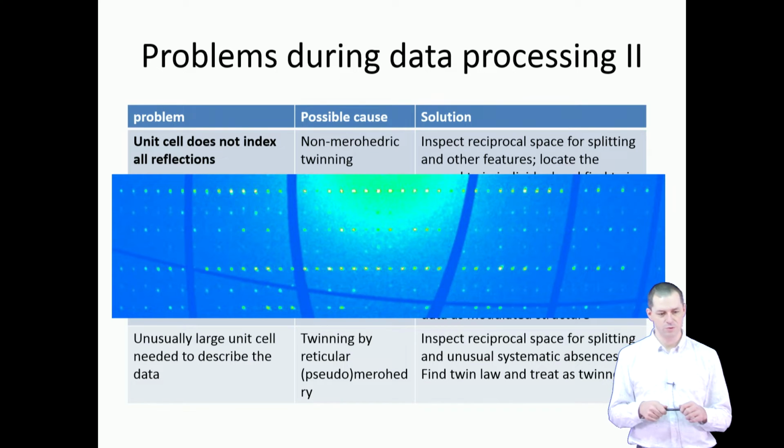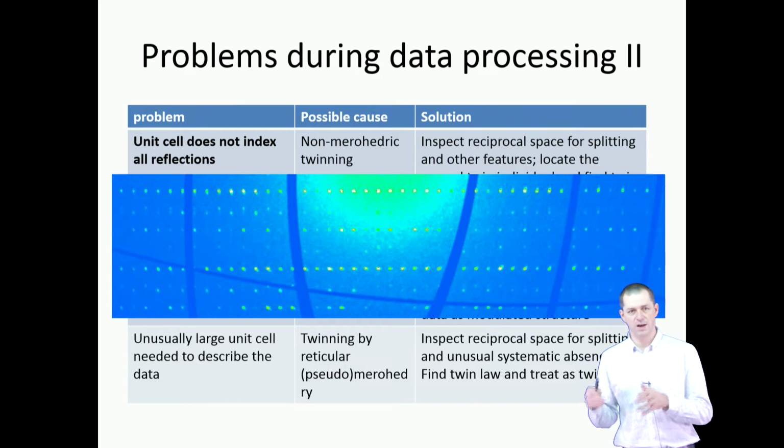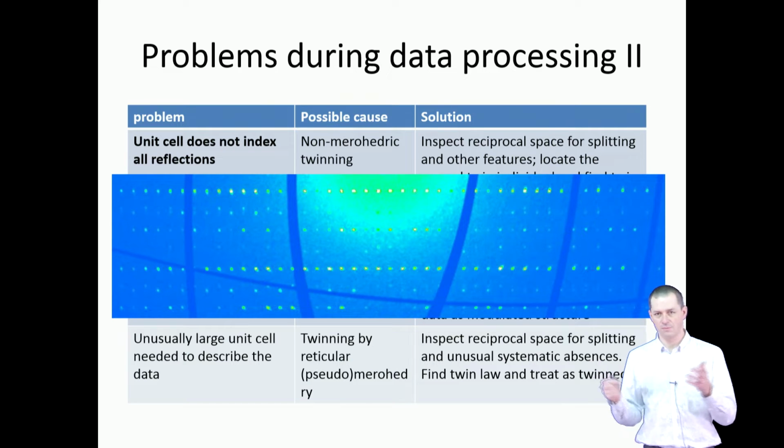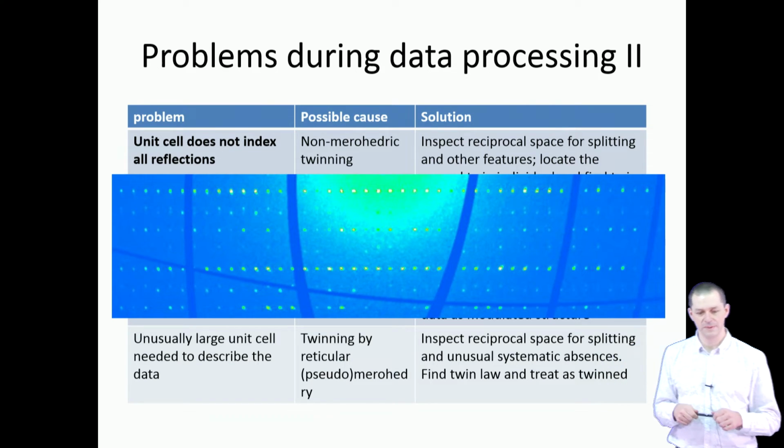This is important. It's important to keep track of this fact, otherwise you may provide a structure to someone who believes what you did is the real structure and then may make false conclusions.